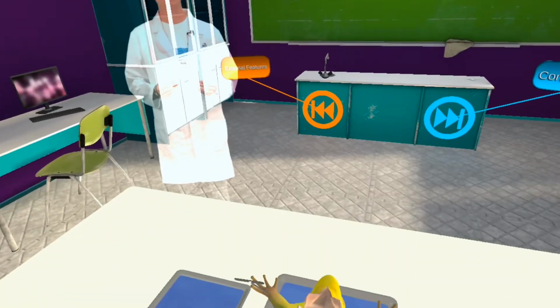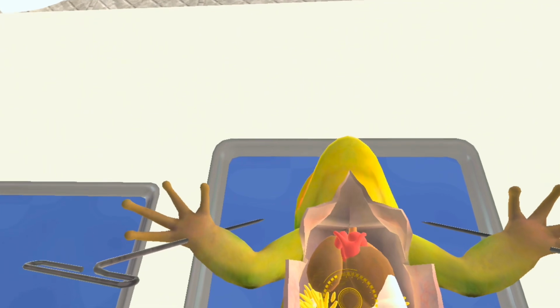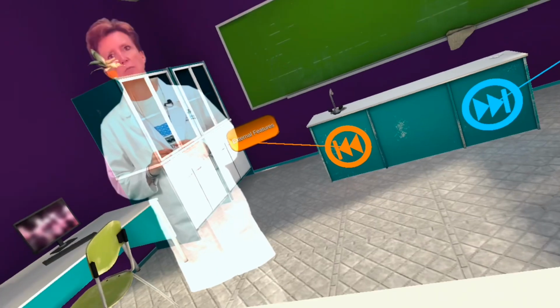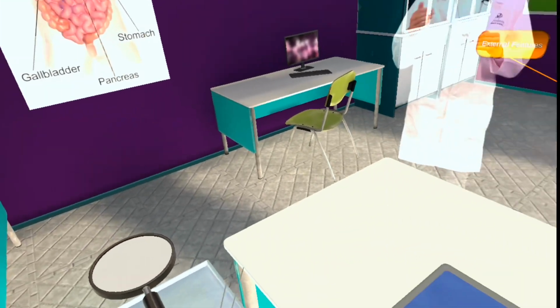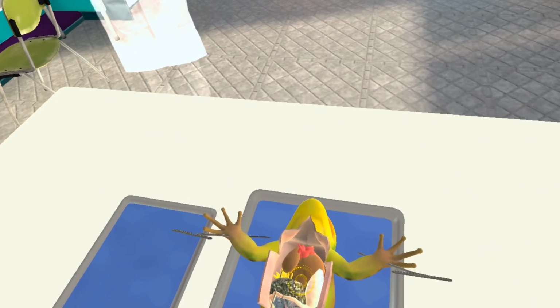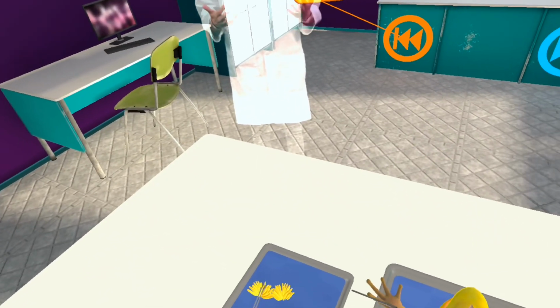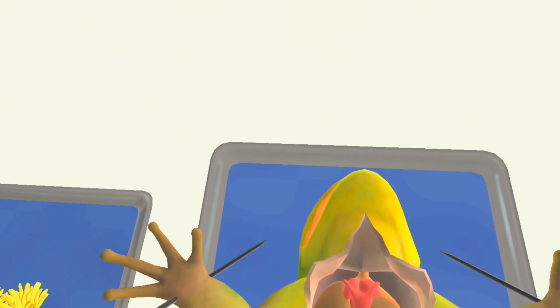Now look into the body cavity. Going in. Yellow finger-like projections on the sides are fat bodies. It may be necessary to remove some of these with forceps in order to see the organs clearly. They can be placed in the tray next to the frog. What tray? Oh, this tray. Fat bodies provide extra fat for mating, metamorphosis, hibernating, and protection of the eggs in a female.